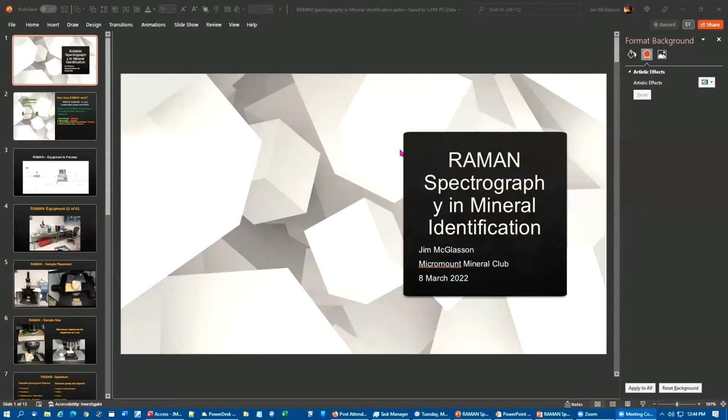First of all, let me say that I think I've gotten myself into one of the best volunteer jobs available in the world. I've been volunteering for the last 4 years with Dr. Young and Bob Downs on the RRUFF project, which is compiling a database for Raman spectroscopy at the University of Arizona. So this is a very quick and dirty overview of Raman spectroscopy.